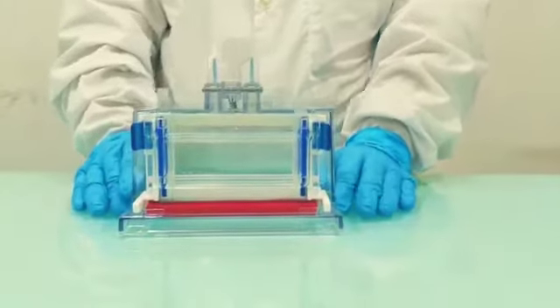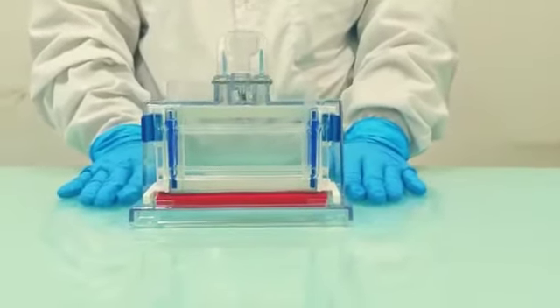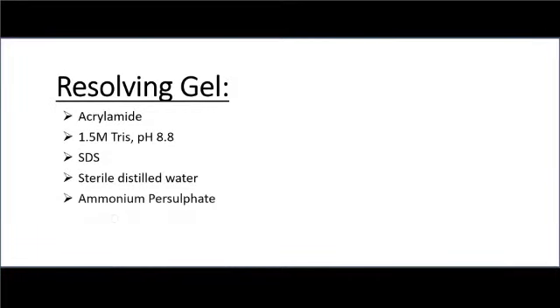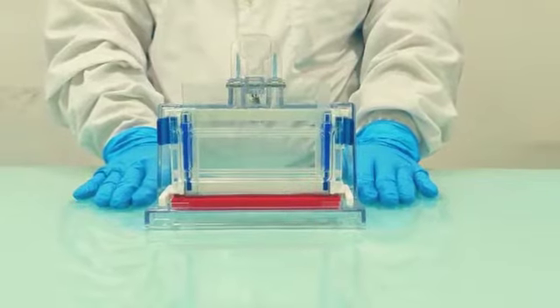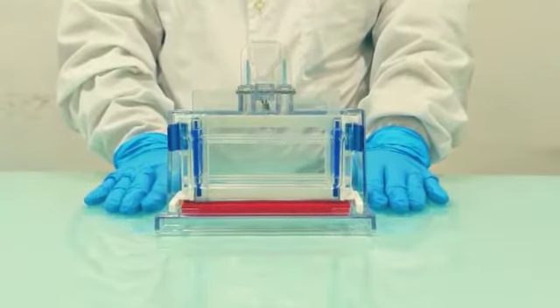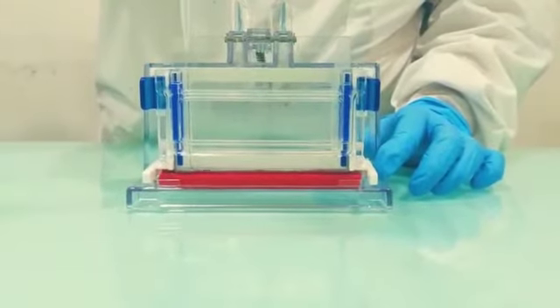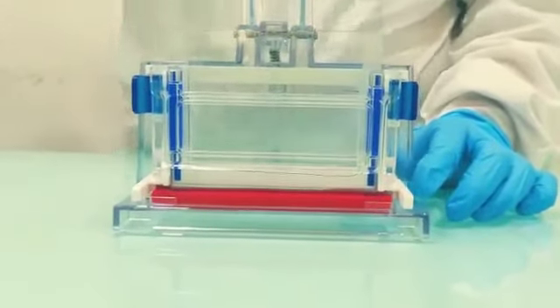Okay, now we will cast the resolving gel. The recipe includes these components. Add TEMED in the end, as it initiates the polymerization reaction. The recipes may vary, but the ingredients are the same. We will start pouring the gel between the plates till the mark. Avoid air bubbles.